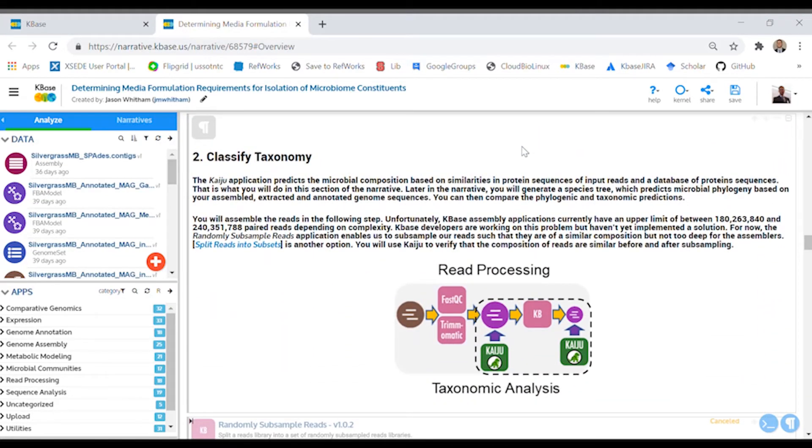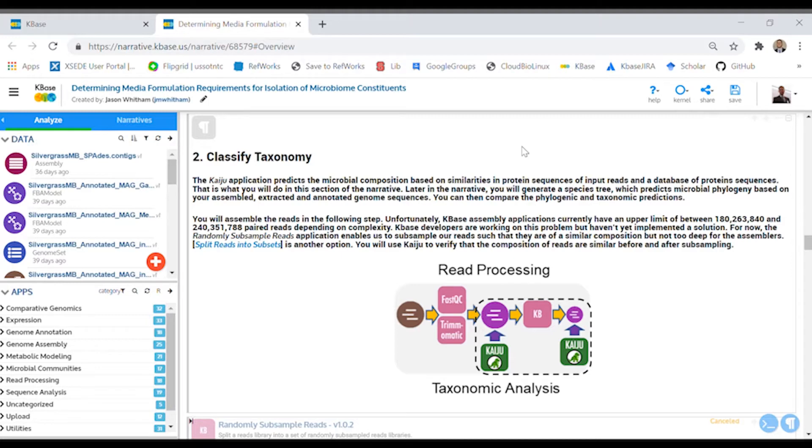Next, you'll evaluate the taxonomy of reads in your dataset, because the following step, assembly, is very computationally intensive and there's a limited amount of computer power you can access in KBase. You'll need to randomly subsample your reads so your assembly job doesn't fail. After you subsample and before you assemble, you'll want to check that the taxonomy of your reads still looks the same as the original dataset.